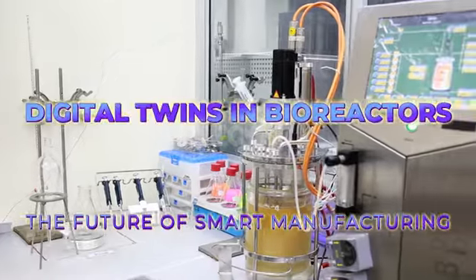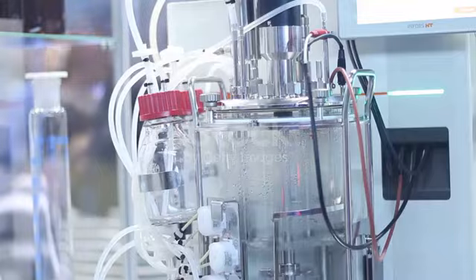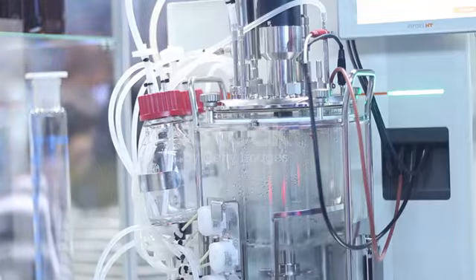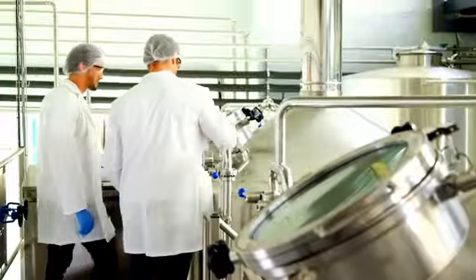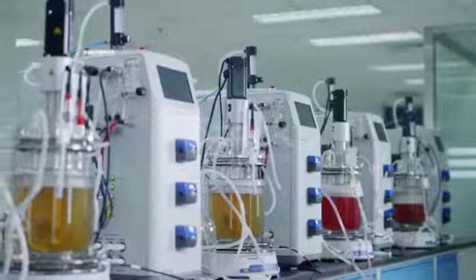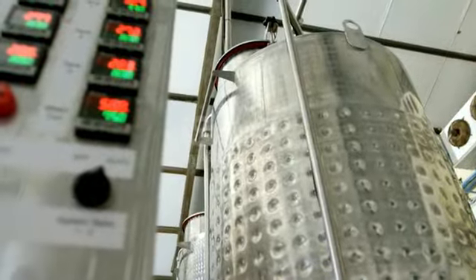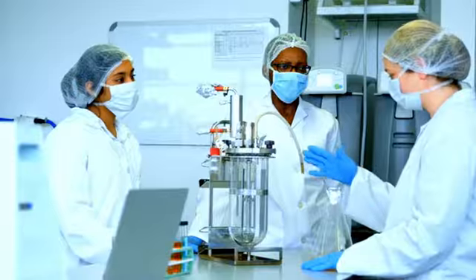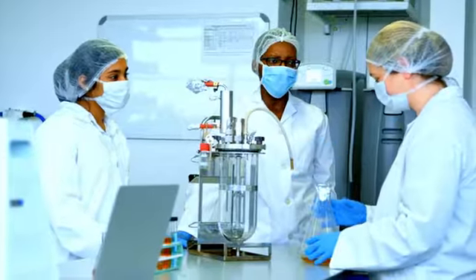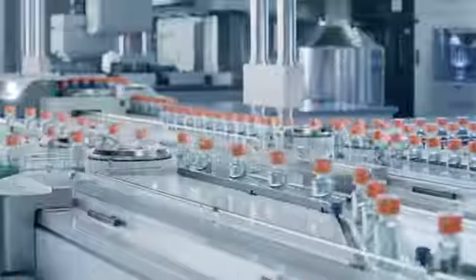Digital twins in bioreactors, the future of smart manufacturing. Imagine a virtual twin of your bioreactor running in real time alongside the real thing, predicting faults before they happen and optimizing performance automatically. Welcome to Digital Twins, the next revolution in industrial biotech. Today, we'll discover how researchers are using them to make smarter, more reliable bioprocesses.